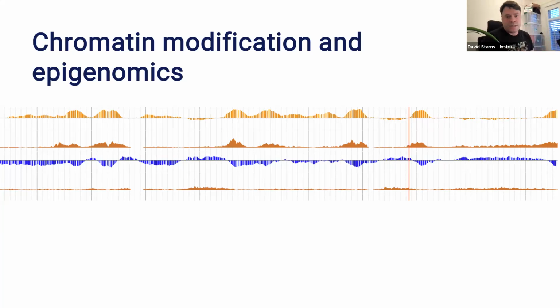We have all this data in our website, and of course, as Omar elucidated earlier, just click on the select tracks, and you can look up. There's a whole section on this, so maybe read up about what they do, because each sample will be different. Whether it's an H3K4 methylation or an H3K9 acetylation, just double check what they can actually mean before going ahead and making your inferences.